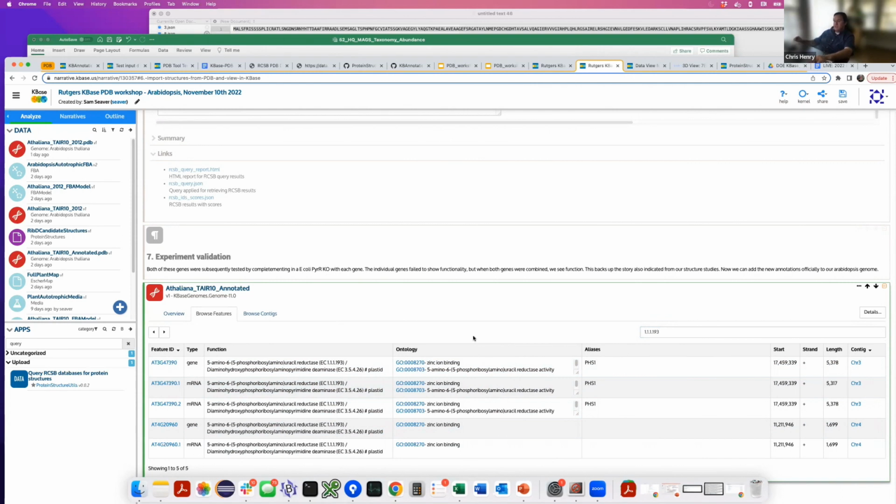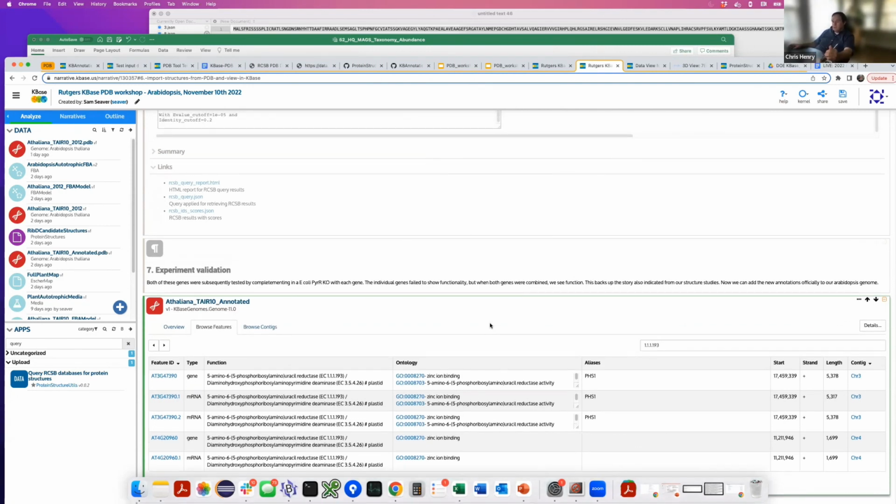So there's a mystery for you: plant proteins are interesting because they can provide insights back into microbial functions, because of the degree of fusion of functional domains that happens within plant proteins. So yet another application here, and another value of having the Arabidopsis structures now available in PDB, as Stephen and the team have done. Now that those plant structures are there from AlphaFold, you have that resource to go back and do those alignments to microbial genes and learn new functionality information, not just about plant genes, but about microbes as well.